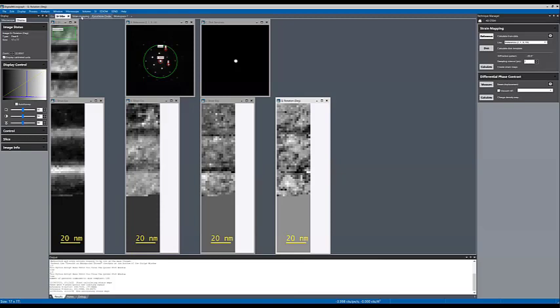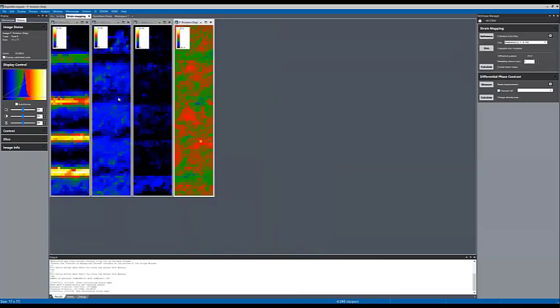I have these actually colored here. So you can see from the top, we had the silicon region. I told you that we have increasing germanium as we go down, and you can see the strain increases. Here is showing you what is the range, the color.